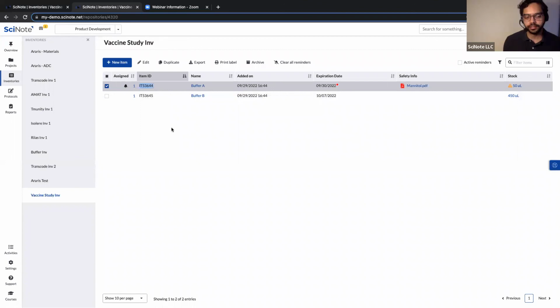Correct. All right, so our next question here is, how do the changes added into the integrated Excel file appear in audit trails? I believe what they're asking is that if you make an edit in your Excel file, does it appear in the audit trail?